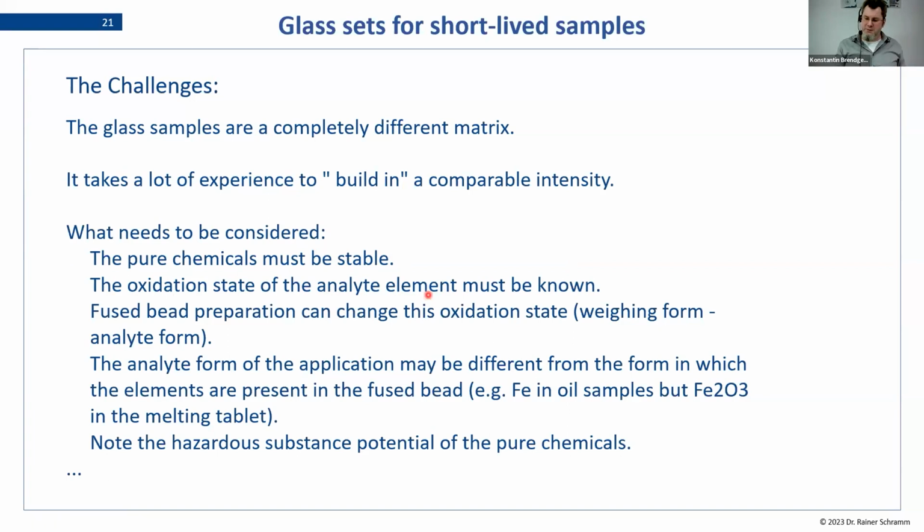Remember in the beginning, I said we are only counting atoms. So the oxygen attached to these atoms, which make up the oxidation state, don't really matter, but they matter for balancing. And in the end, what we want to do is we want the fused beads to represent or to simulate the oil sample in our example. So that's where the difficult designing comes in.